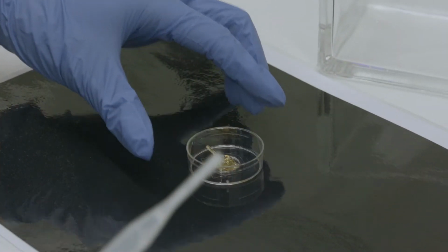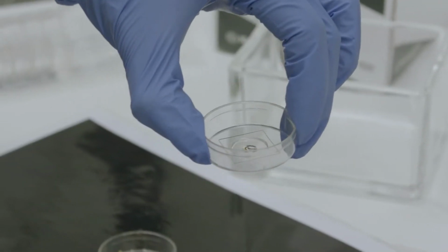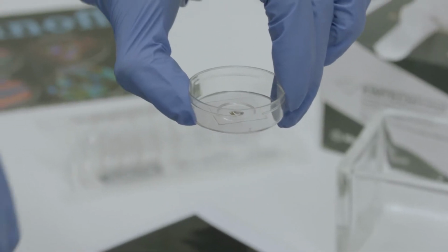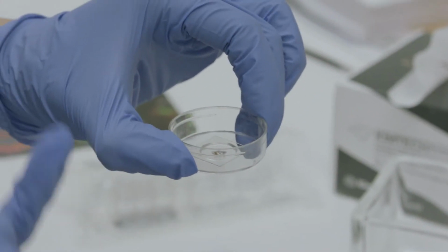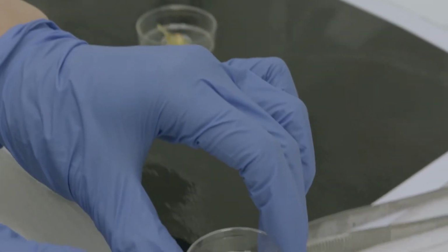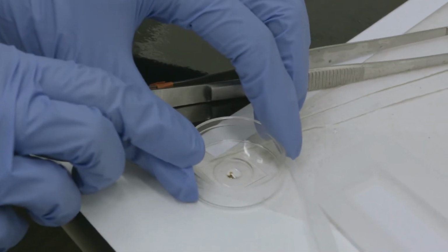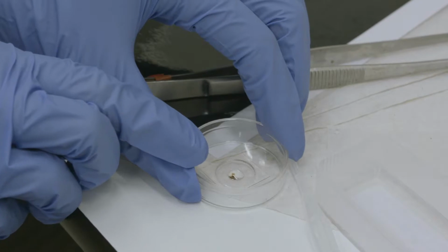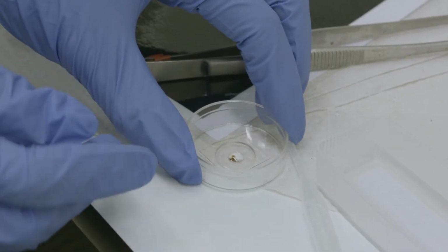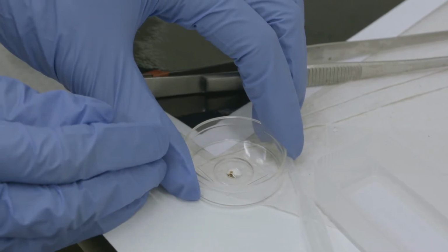In the case that you have small samples, which are ideal for confocal microscopy, because you can image the whole small sample, for example a whole organ, as a very big overview in high resolution, then it's even easier. You see here in the middle we have a tiny adrenal gland, fitting exactly in the middle of the cover slip, and then we have a drop of BABB to cover it.